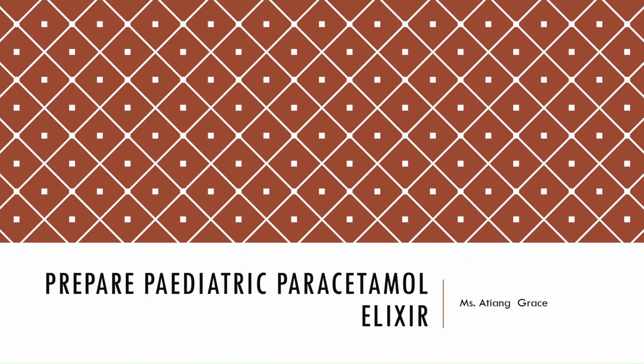On this episode, we are going to look at how we prepare pediatric paracetamol elixir. Elixir, depending on how you can pronounce it. Here in Africa, most of how we pronounce the English terms or how we read can be affected by our mother tongue and our original language. So if I don't pronounce based on your expectation, please focus on the spelling. Okay, so prepare pediatric paracetamol elixir.